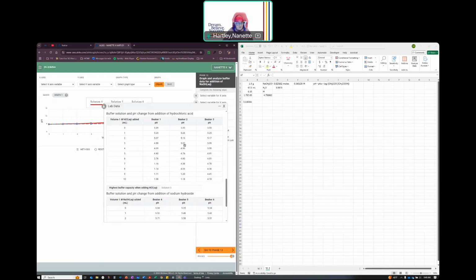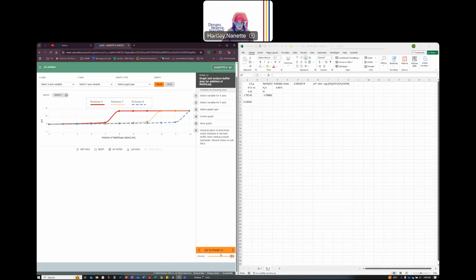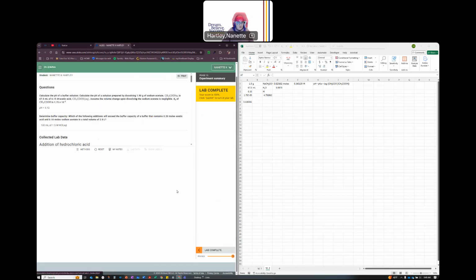So solution 6. Hooray! And that was all of what I had to do. Awesome. So going back into data, I want to go back.